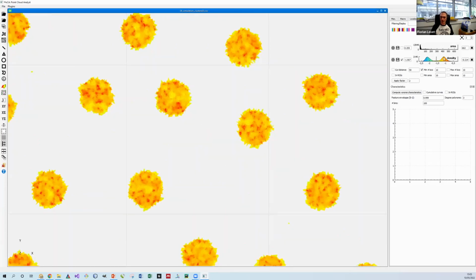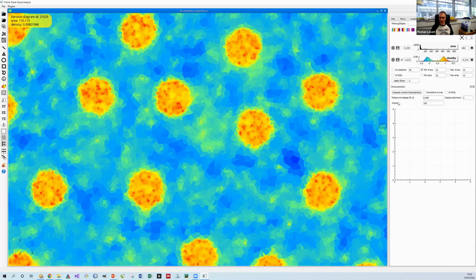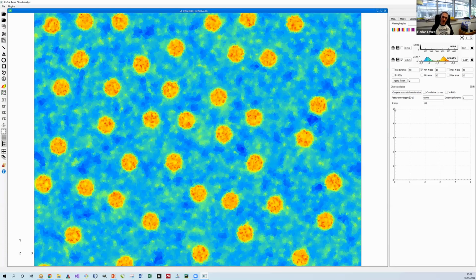If you apply a filtering like that and you go to create object, it will use your current thresholding basically. And this thing is still ongoing, but it's basically the implementation of the technique I showed you from the guys from Strasbourg in order to do clustering with Voronoï.